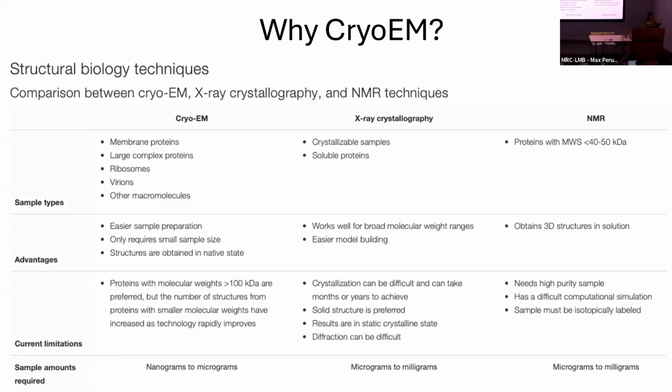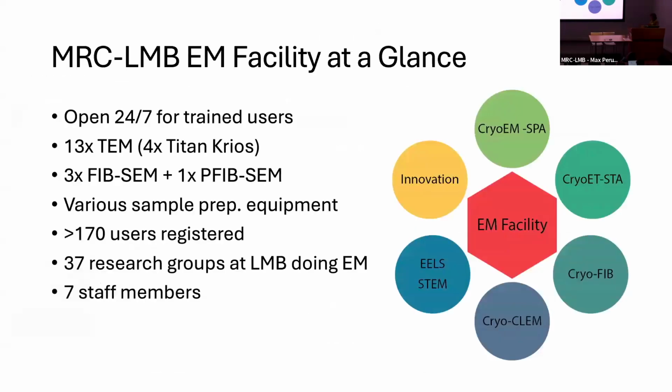So what is your advantage of X-ray? He gave a very good answer: a lot of drug development, the pharmaceutical companies, use X-ray crystallography to screen compounds. Because the molecule is very small and you already have a crystal structure, you can try eight different compounds to see what changes and which one is bound. This is the way to do what is called structure-based drug discovery. So it is still very useful. We have different samples to shoot for cryo-EM.